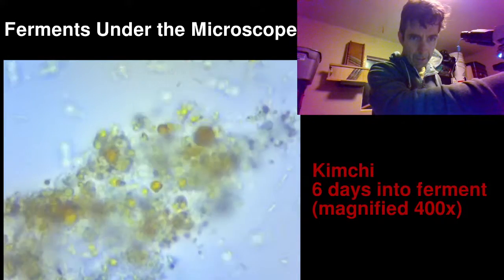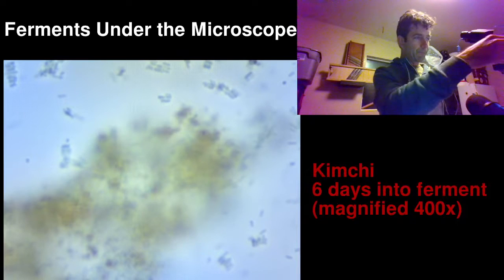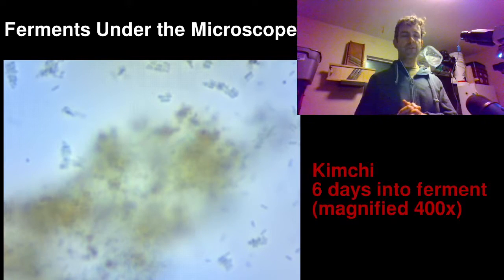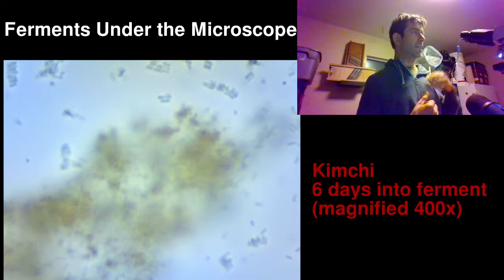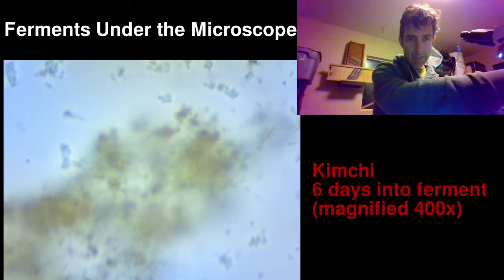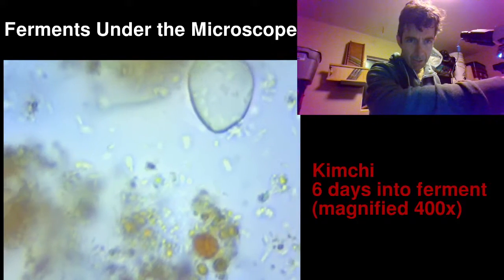Zooming up and down through the medium — I think this is 400 times magnified. The reason I say I think so is because the objective, the magnifier right on top of the slide, is one component at 40x, and the eyepiece is the other component with a different magnification. If the eyepiece is 10x, then 40 times 10 is 400x. The camera replaces one of the eyepieces on this model and is probably 10x, so that's why I say it's probably 400x. A thousand X would be the other option but probably not the case.